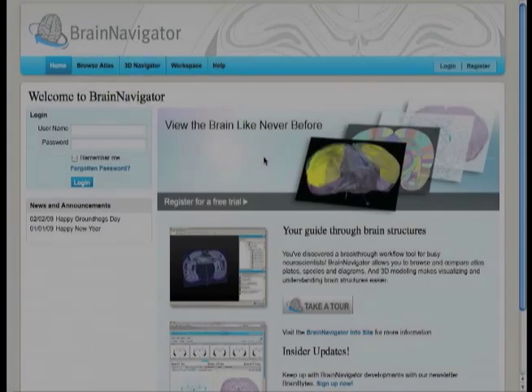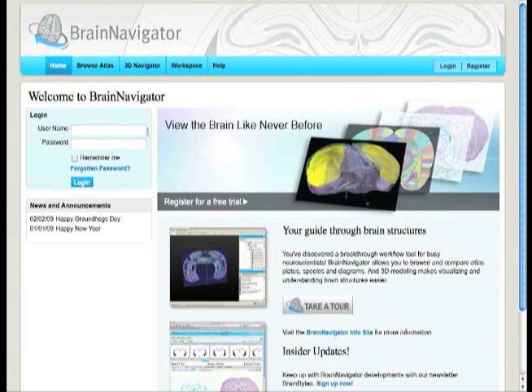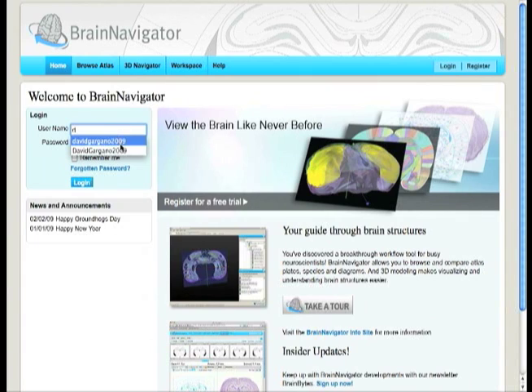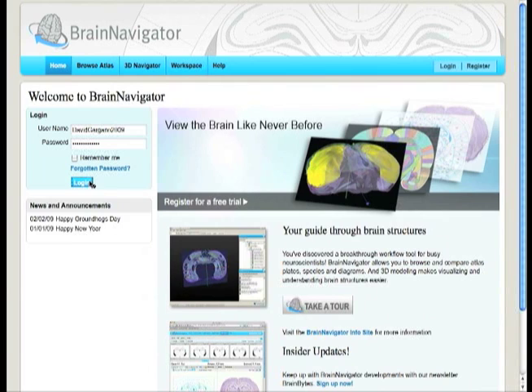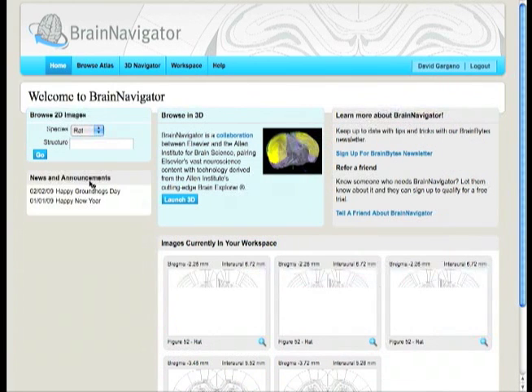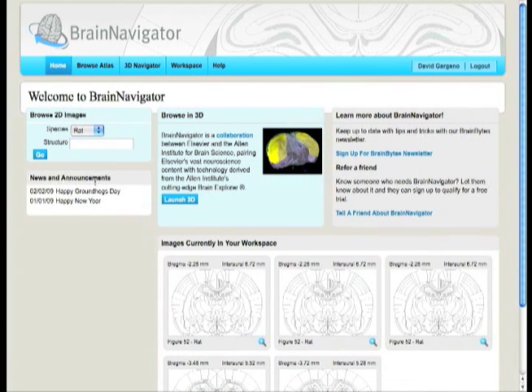Rat and mouse brains are small and complex. In brains so small, precision is extremely important. A variation of a mere millimeter can make a big difference. Brain Navigator will change and enhance the way you view brain structures by allowing you to explore them and their relationships with precision in 2 and 3 dimensions.